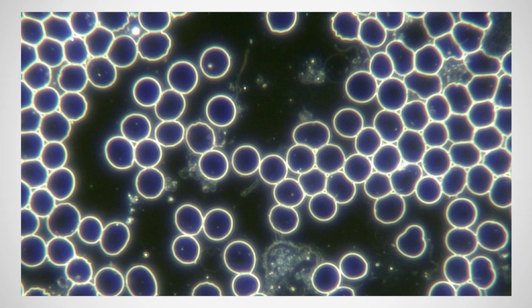So asci we will be looking at, but these are very advanced growth forms in pleomorphism, indicating chronic imbalance of the terrain and chronic high levels of acidity. And the value with pleomorphism in your analysis also is that we're often able to see these patterns that point to more long-term chronic and potentially degenerative things, where your bright field anomalies might not indicate anything potentially degenerative. So really important if you want to understand properly what's going on in a case.